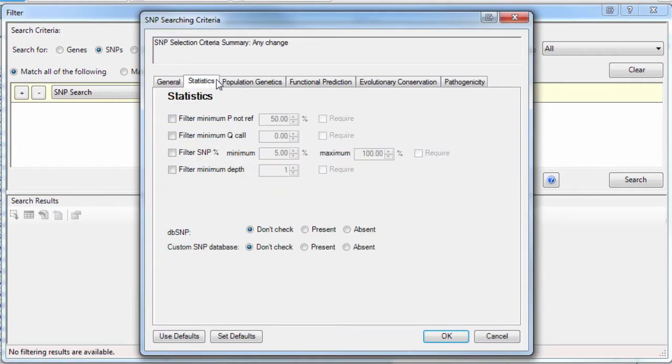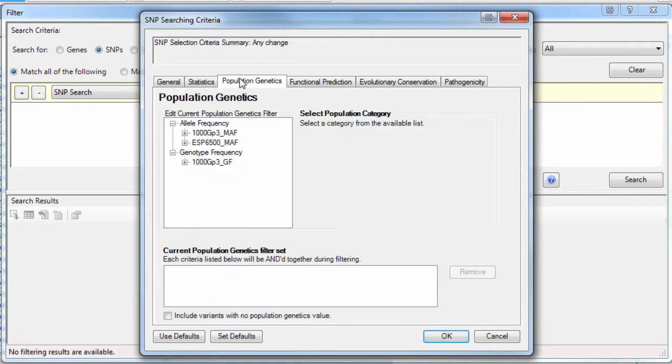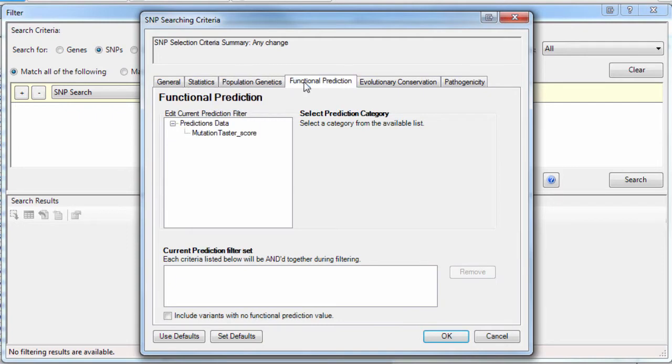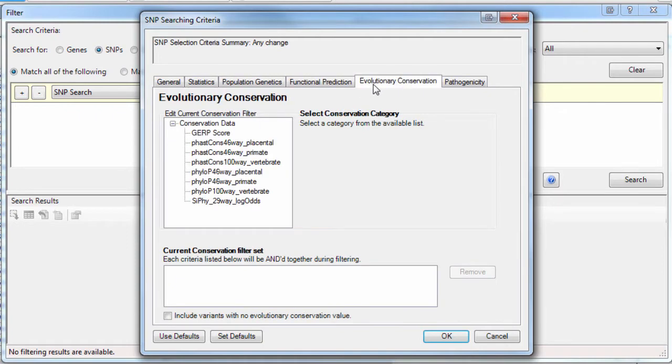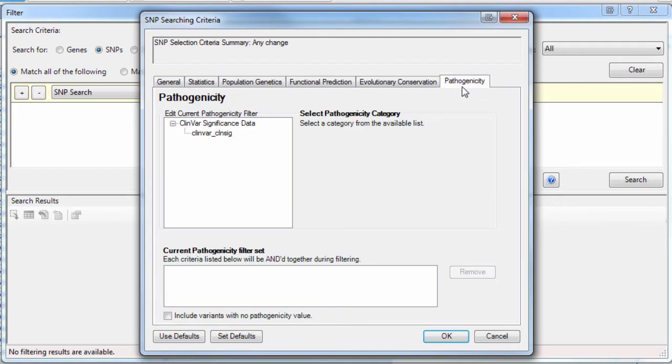This includes our Integrated Variant Annotation Database, which allows you to locate important variants in human datasets based on population genetics, functional predictions, conservation, pathogenicity, and clinical significance.